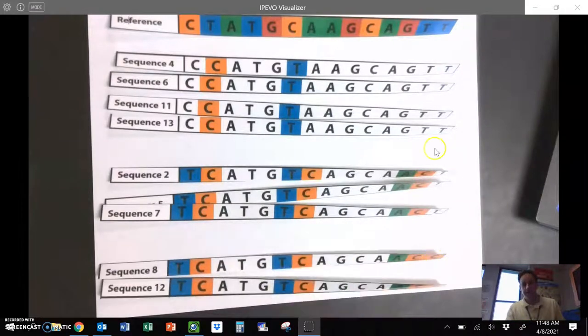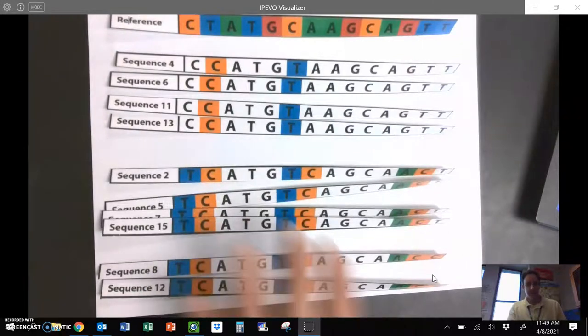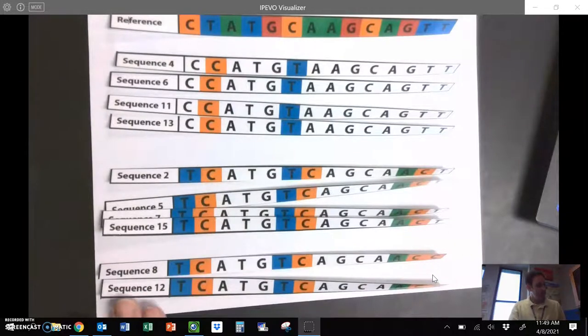So you can kind of see there's been 3 major phases of mutation that have taken place and then spread throughout the population. This original C and T mutation, this next group of 4 that came around, and then this last group of 1. Now, in addition to that, so 15 goes up there with that, there's also some oddball sequences.